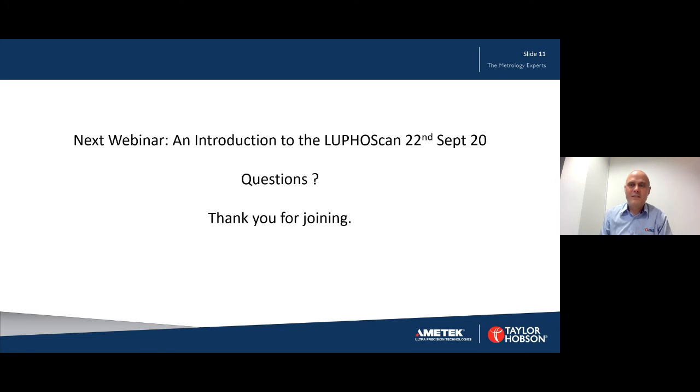If you want to analyse Zernike, you don't do it directly in the PGI Optics, you would do it in Talymap. We have an additional utility on there that allows you to do the Zernike analysis, so it's quite simple and straightforward. At the moment, we can take the text file from the PGI Optics and input it into Talymap, or we have the same functionality in Talymap that can be opened automatically from the PGI Optics to do the analysis if you want to include Zernike.